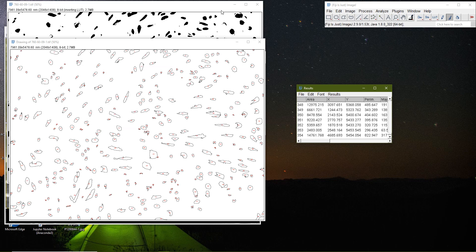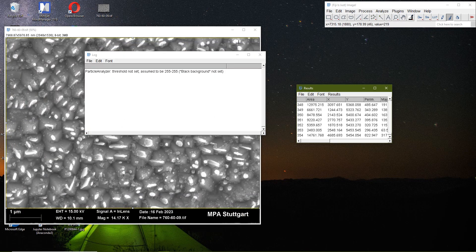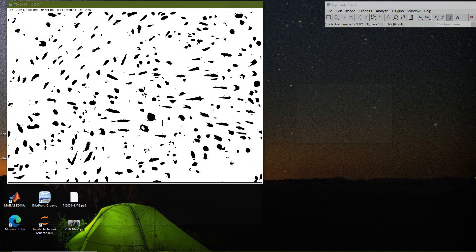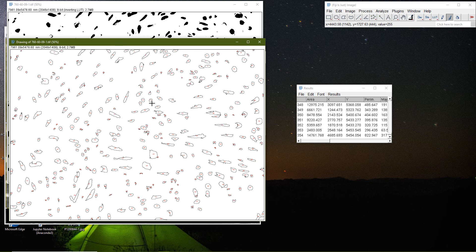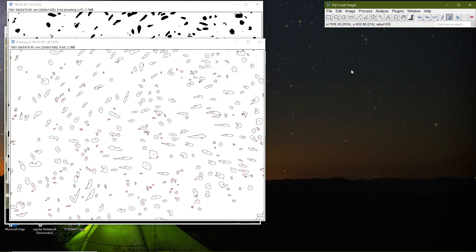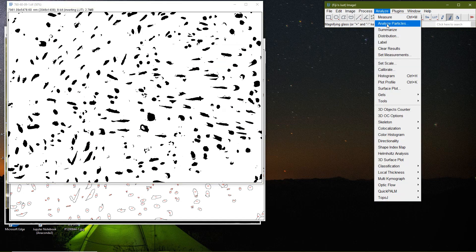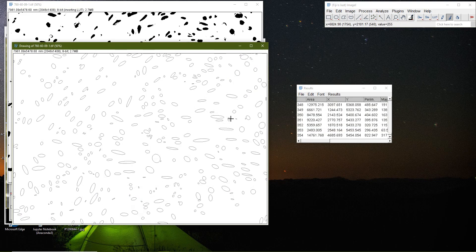I want to save all these pictures — this outlined image and the image showing what I selected. I close the results, then go to Analyze > Analyze Particles again on the same picture, but this time I select Ellipses and press OK. This opens a new image without closing the previous ones.